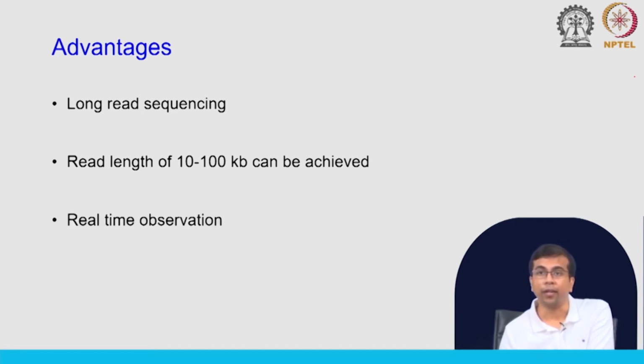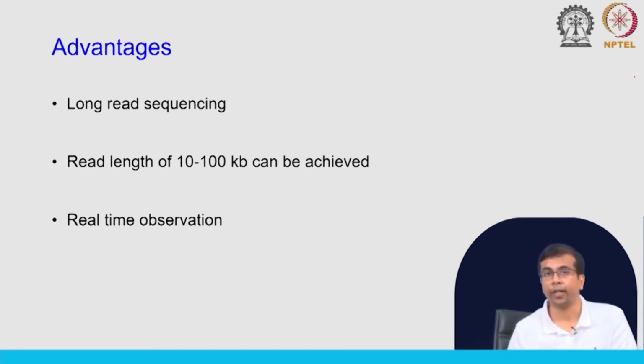Okay. In addition, as you have seen with SMRT, we have real time observation of the current, right, the change in current that is happening, that is the signal, and we have real time observation of what is happening to the current with respect to time, and this data is stored in the data file that comes from Nanopore. So, when you talk about these data formats, you will see we have this data in there and this data is stored, and that can be quite useful for specific applications.